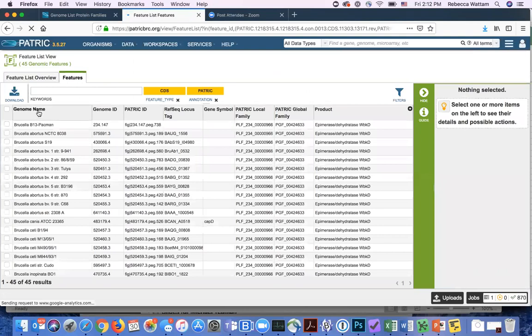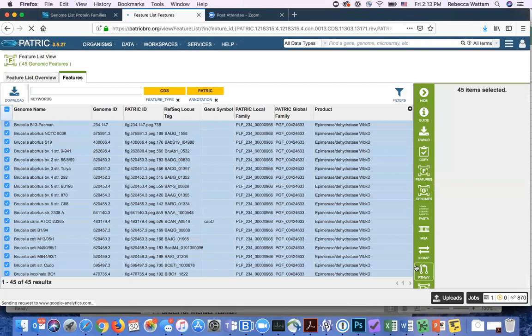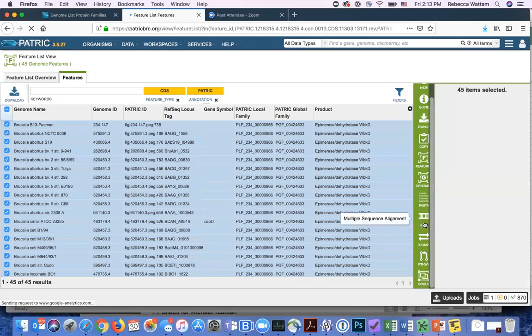This first column is genome name. If I click the check box next to it, it selects all the genes in the selection and you'll notice that the vertical green bar is now populated with choices that you can make from that. And one of these is the multiple sequence alignment.